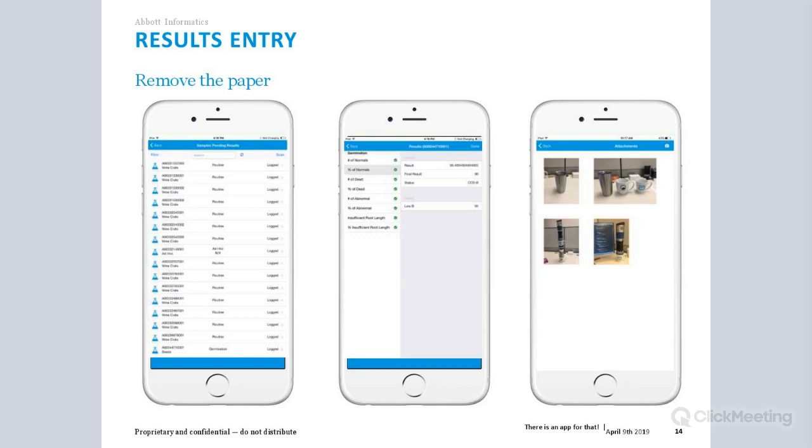Okay, so this is funny, and again, this comes from my experience in working in labs. A common problem laboratories face is not having enough space. So often, completely replacing paperwork, you do need to have one computer per analyst and have computers located where the resulting is being conducted, on prep benches and things like that.